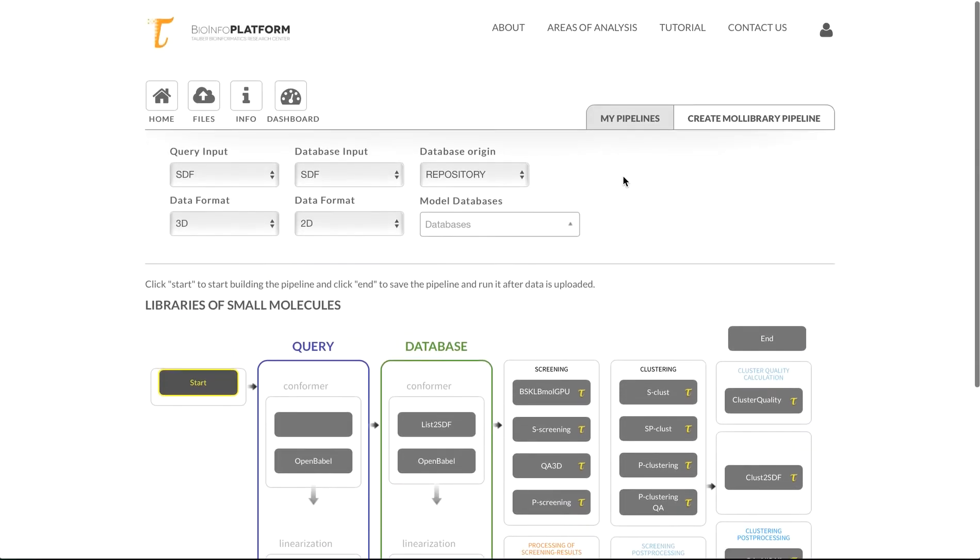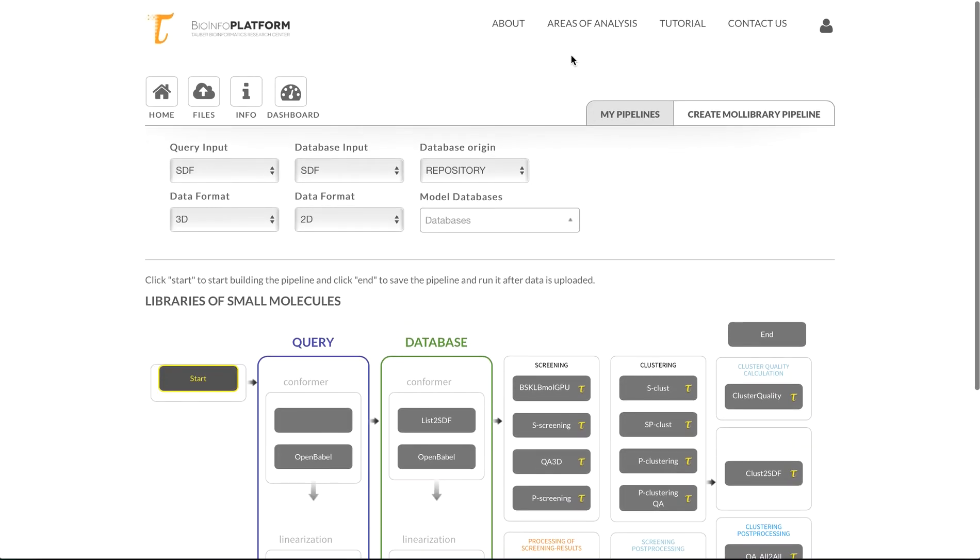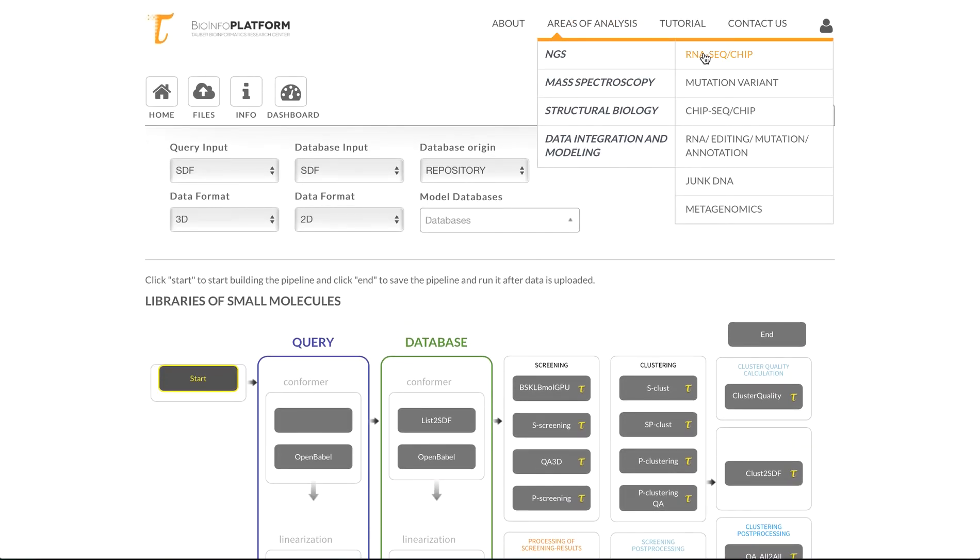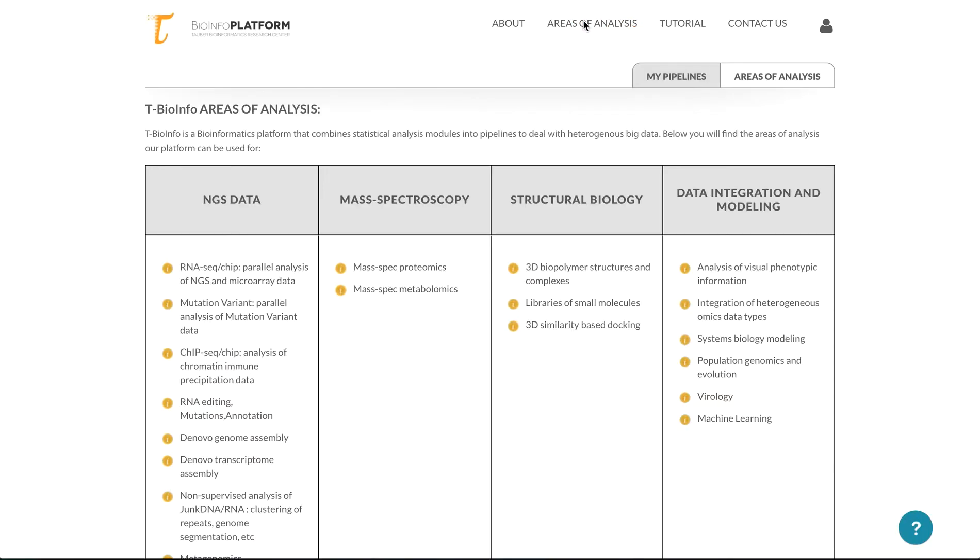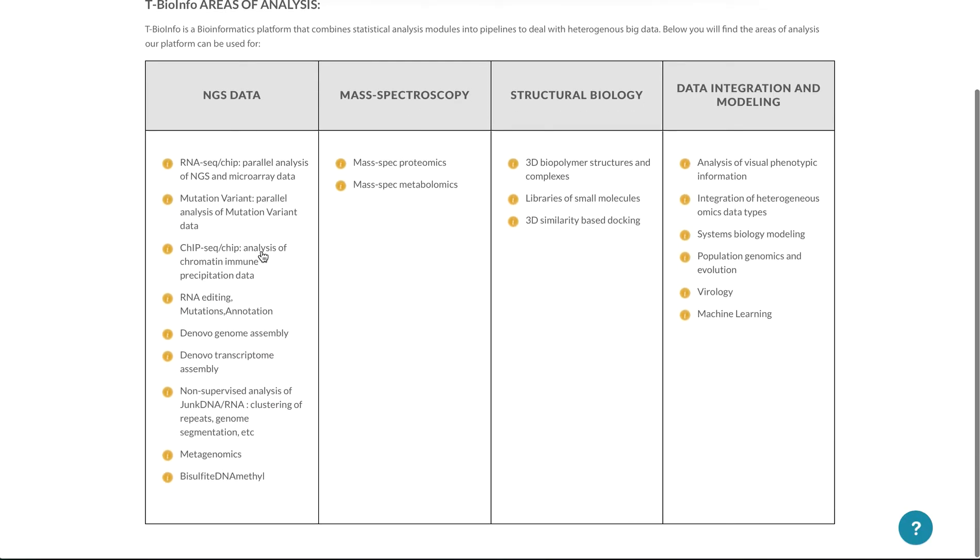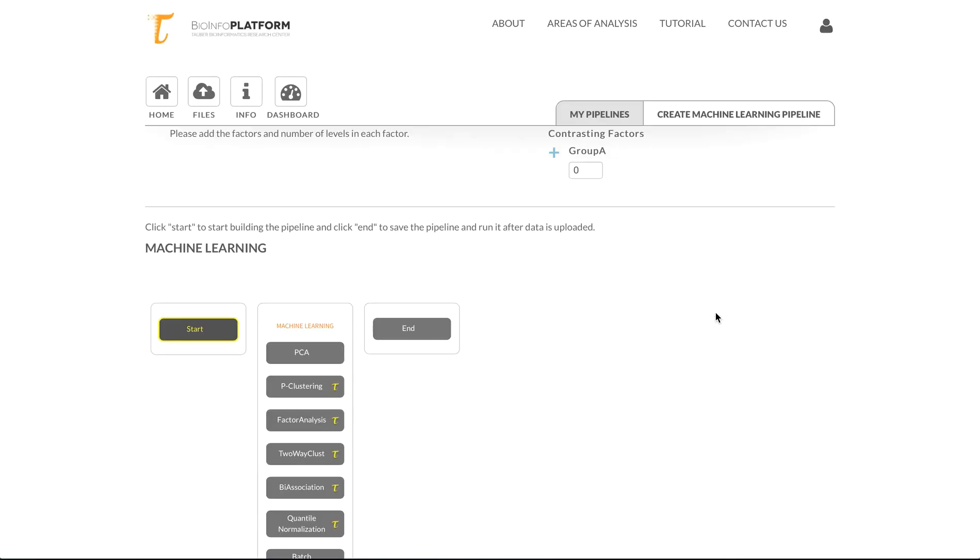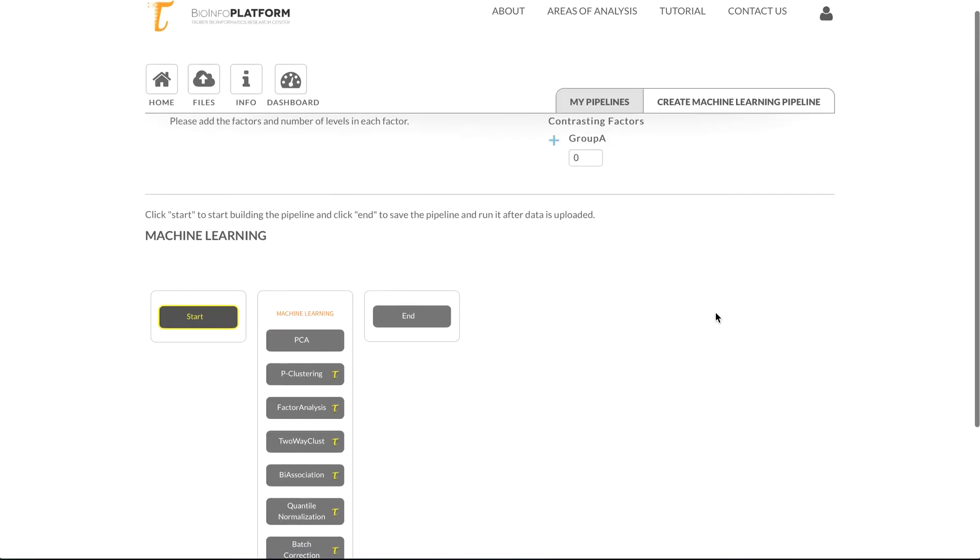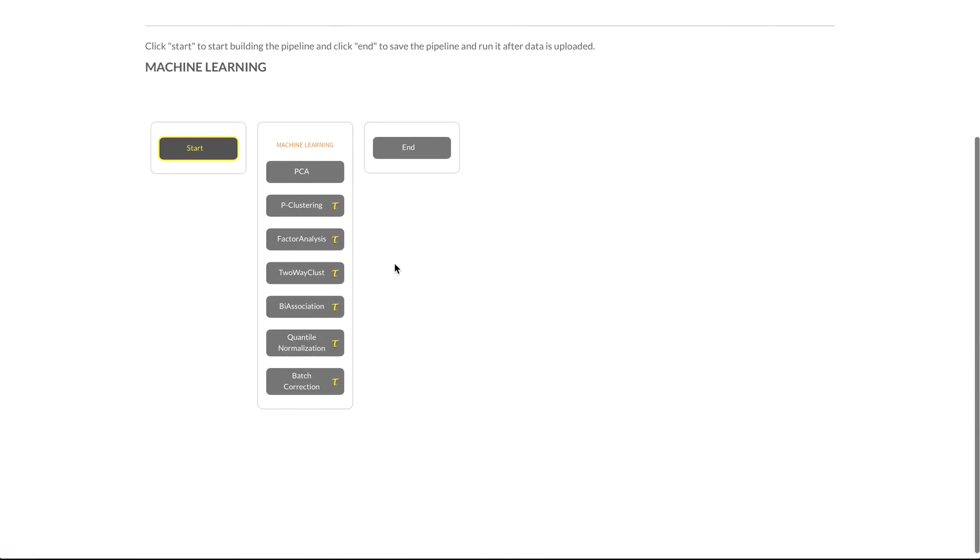So similar pipelines are available for many different types of analysis. For example, we have bisulfate, metagenomics, assembly, non-supervised analysis of non-coding DNA and RNA, and also a section for machine learning that has some typical machine learning algorithms here. They allow to do basic things like PCA factor analysis as well as more advanced things like bi-association and bi-clustering.